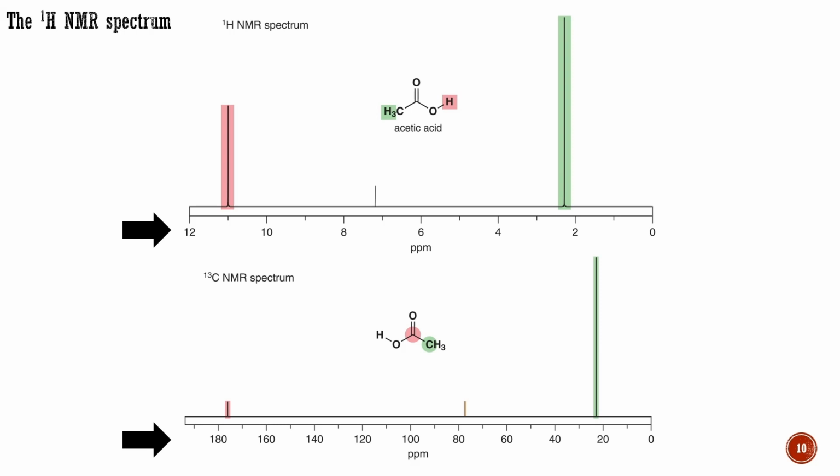This makes perfect sense. The variation in the chemical shift is a measure of the shielding of the nucleus by the electrons around it. There is inevitably less change possible in the distribution of 2 electrons around a hydrogen nucleus than in that of the 8 valence electrons around a carbon nucleus. Nonetheless, the acetic acid spectrum above shows you that, just as you would expect, the hydrogen atom of the carboxyl group, directly attached to an oxygen atom, is more deshielded than the hydrogen atoms of acetic acid's methyl group.